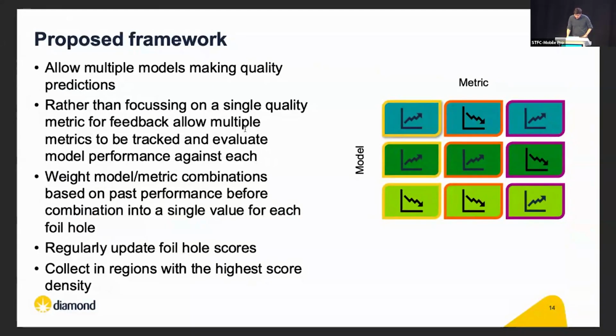The variation is too great. And you might want to consider multiple different models, either machine learning things or things that are just trying to make predictions based on the ice thickness values you see, or physical distribution on the grid or something like that. So we wanted a framework that would allow us to combine information from multiple different models.